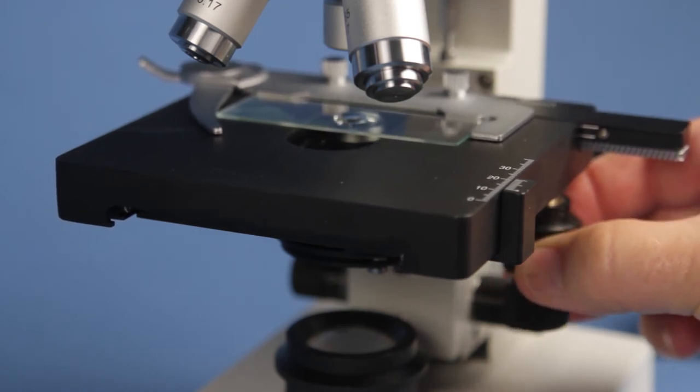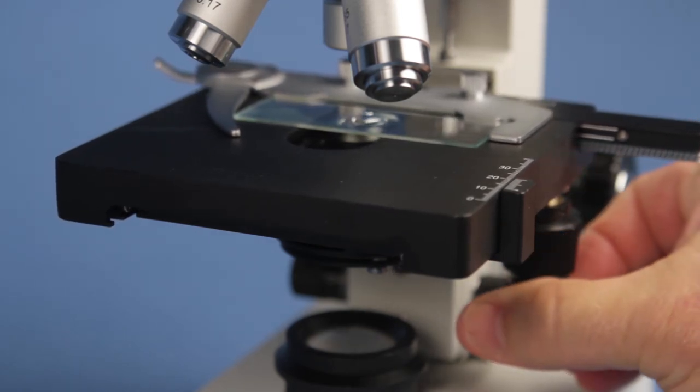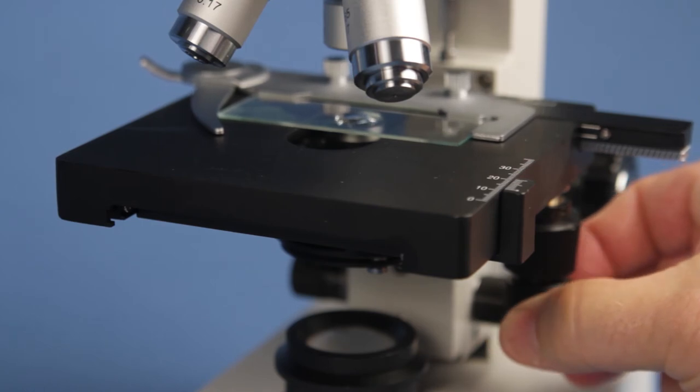The mechanical stage step-up feature allows for easy scanning of a specimen without the need to manually move the slide.